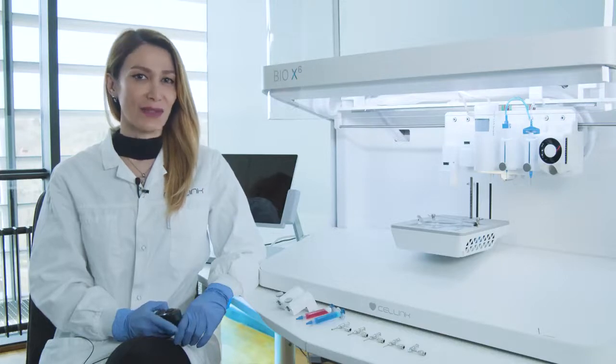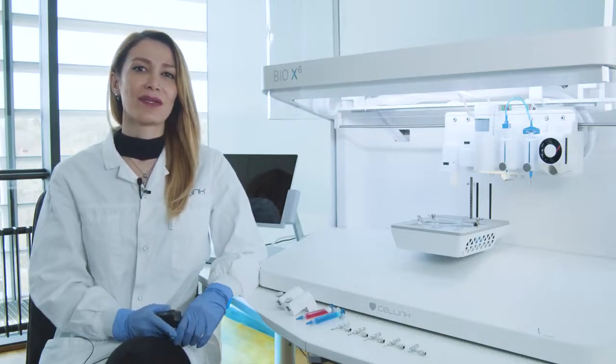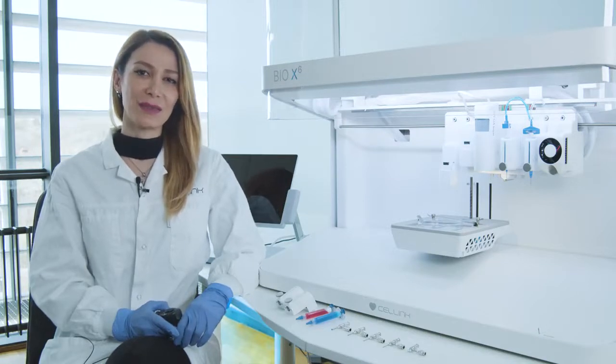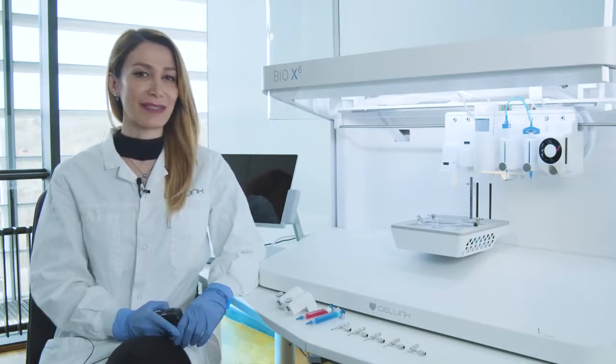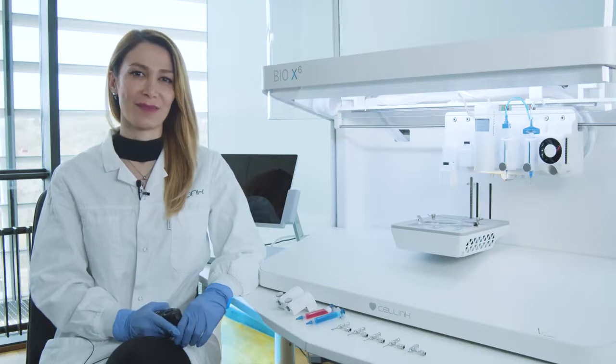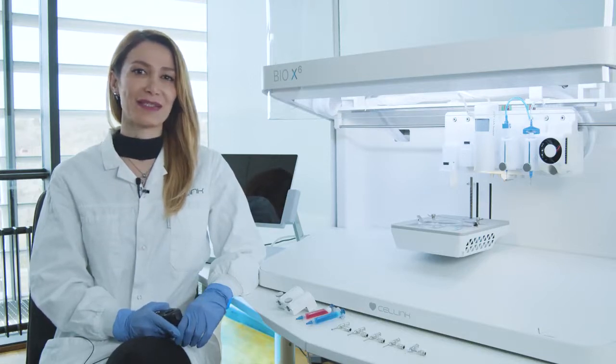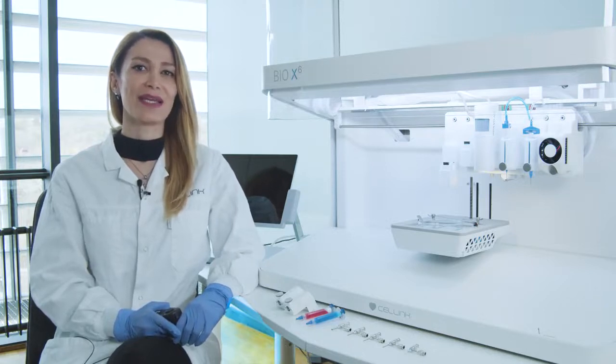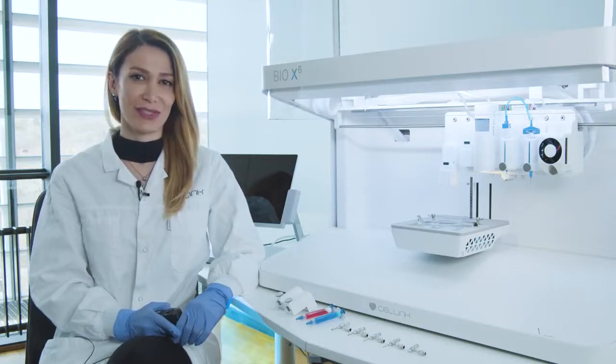Nowadays bioprinting is a rapidly developing technology for the precise design and fabrication of various complex tissues and organs. Coaxial extrusion bioprinting has demonstrated strong potential to enhance bioprinting versatility. Coaxial bioprinting simultaneously deposits two or multiple bioinks into one another in a single filament in a concentric structure.